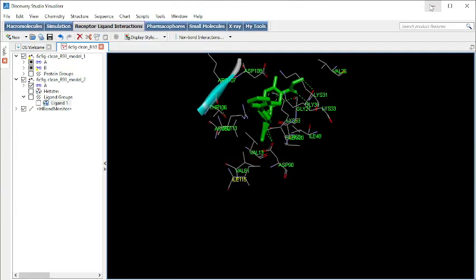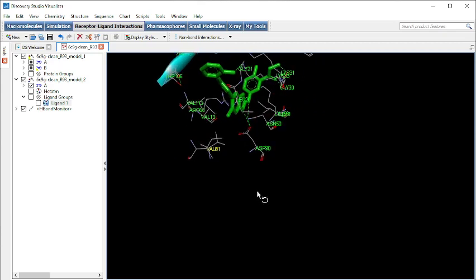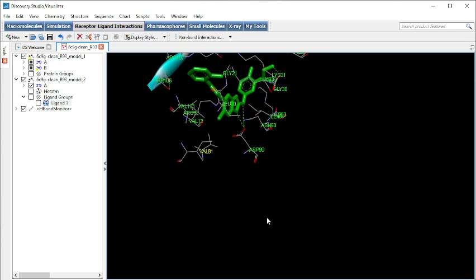Now again go to Discovery Studio Visualizer. I suggest you press the delete button to delete the amino acid which you have entered into the Excel sheet. Now press another amino acid and enter this name into the Excel sheet. This is valine 81.